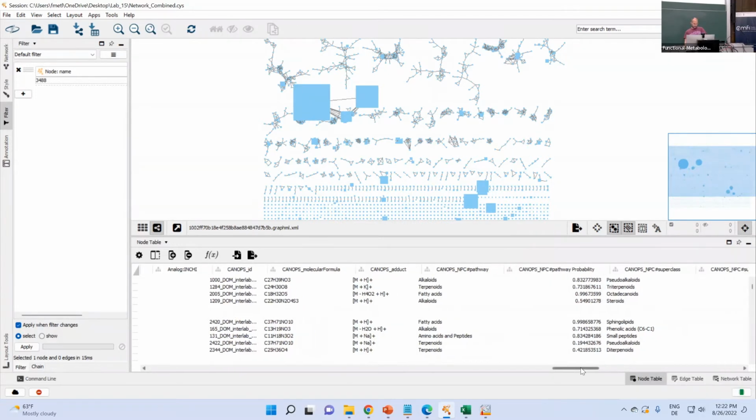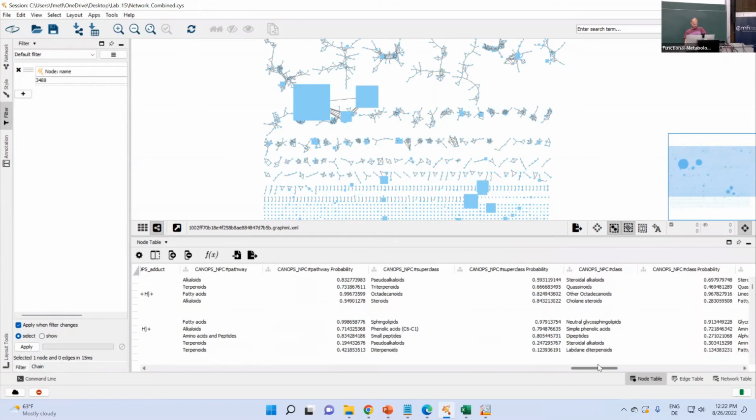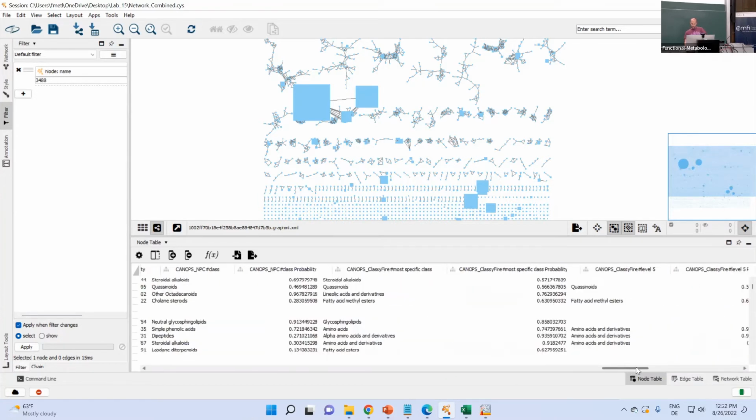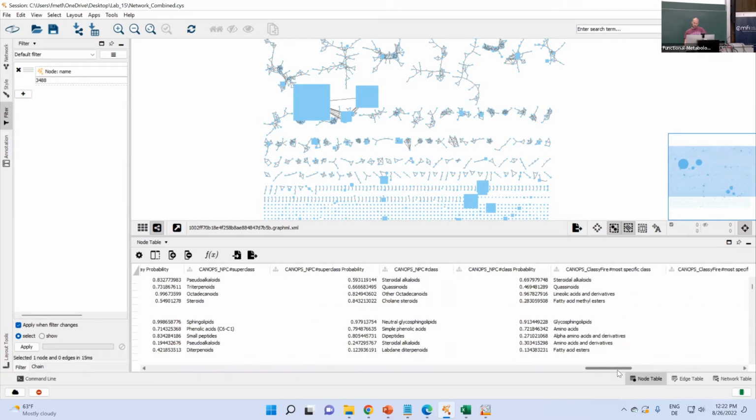I don't know if there were any in silico hits in terms of structure. Oh, I did not import that yet. But yeah, a lot of class level annotations. Again, if you describe it, make it clear this is level 3. So we're far away from an ID'd compound here, but we may get some insights.